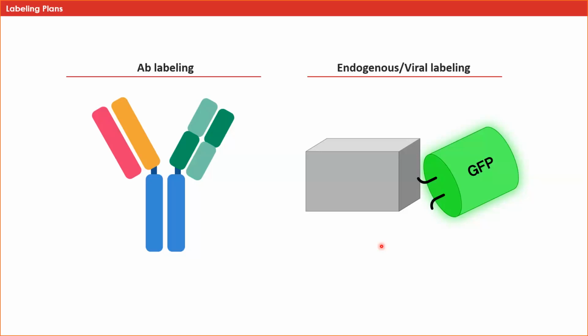With regards to antibody labeling, just about all clearing techniques are compatible with antibody labeling. With some techniques, such as solvent-based clearing methods, antibody labeling is performed prior to removing the lipids, while with others, such as clarity-based methods, antibody labeling is performed after the clearing.